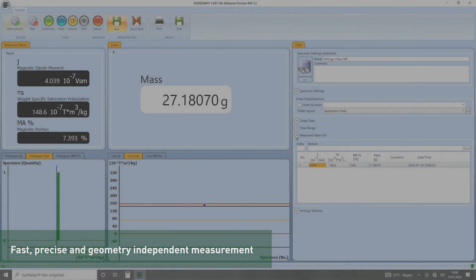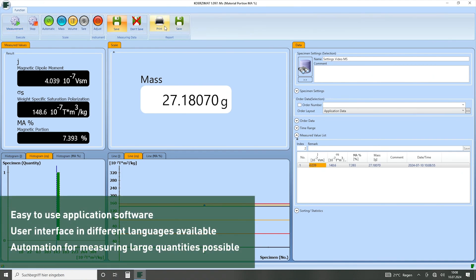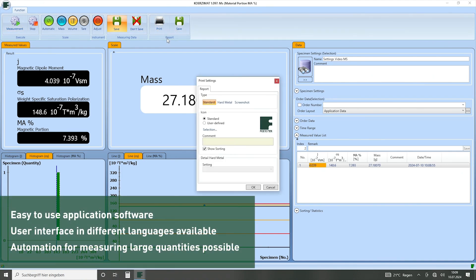The simple-to-use application software, available in various languages, controls and handles measurement and is available for documenting and reporting the measured results.